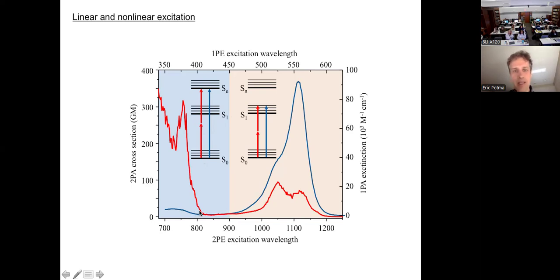And you see that immediately a huge feature shows up because of the implied resonance of 1 photon within the 2 photon process. So the message is the 1 photon and the 2 photon absorption cross spectra are not the same. They can be quite different, in fact.